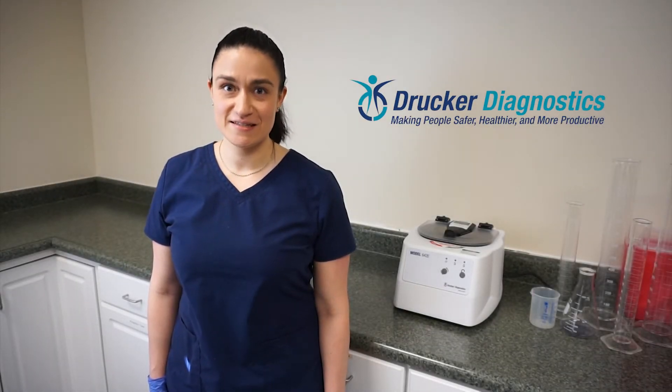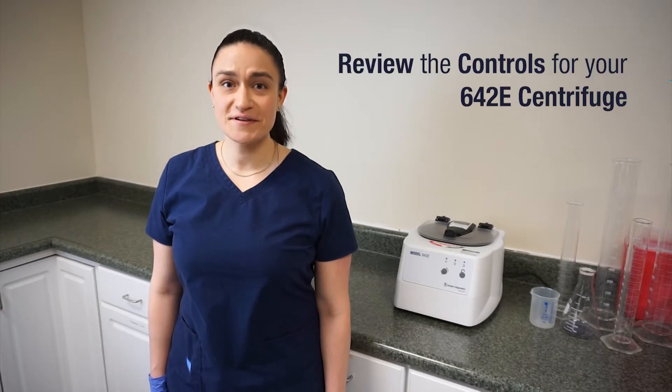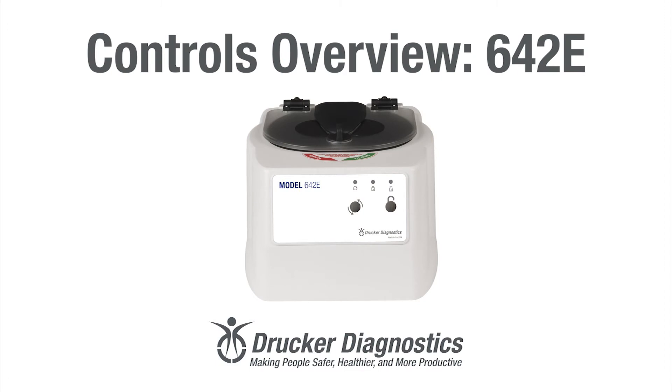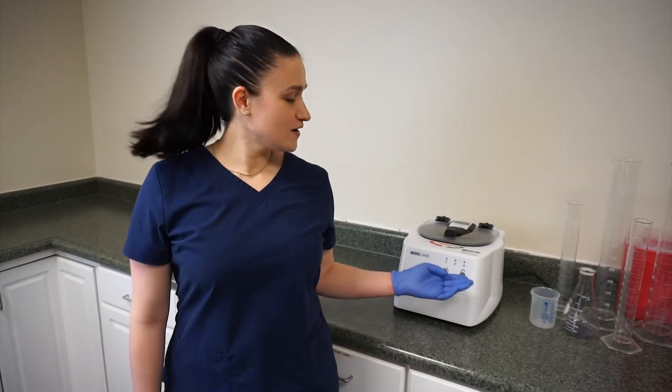Hi, I'm Dawn with Drucker Diagnostics and today we're going to review the controls for your 642e centrifuge. Your 642e is designed to run one cycle: 10 minutes at 3380 RPM, which is 1600 XG. The simple controls for that cycle are right here on the front panel.